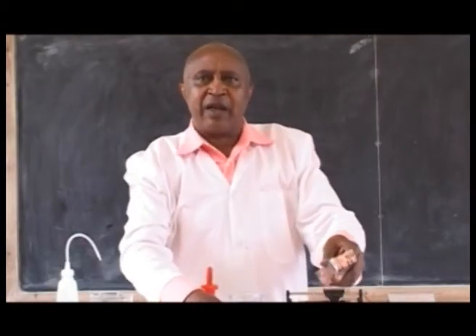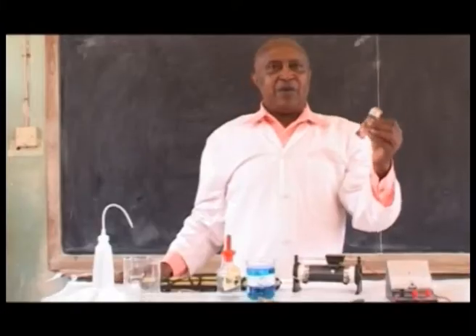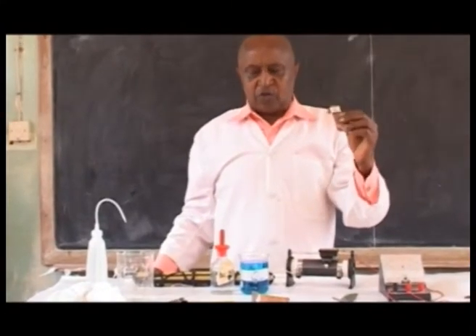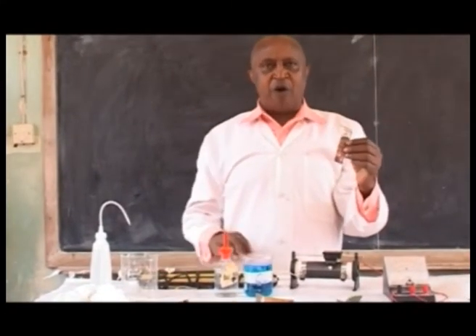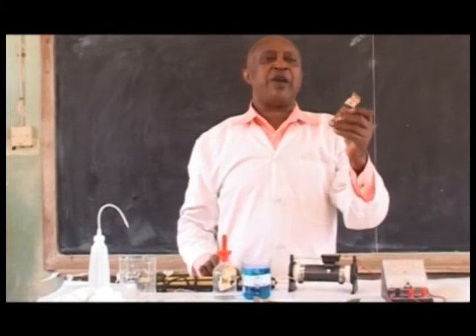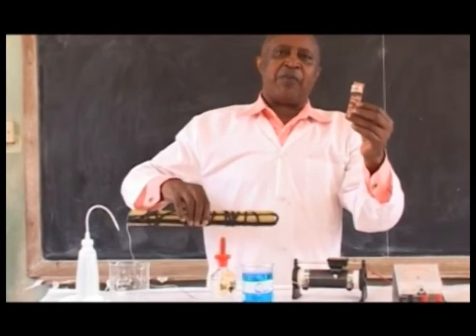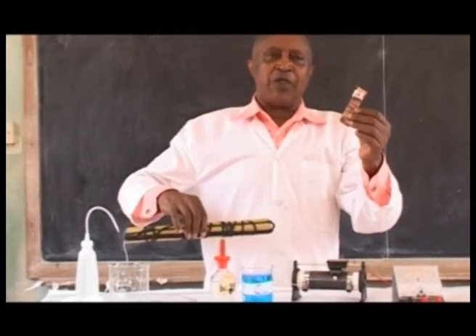Label the electrodes as anode and cathode. Connect the anode to the positive terminal of your battery, where it will be corroded by the electricity we shall be passing through the electrolyte.